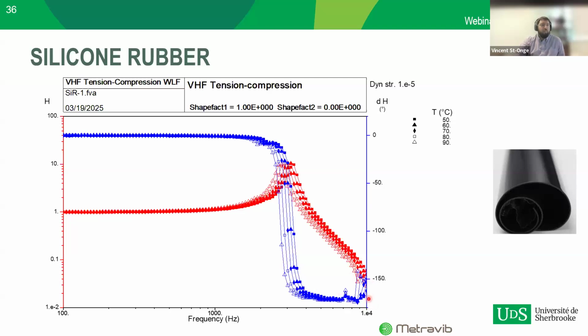So this can be due to poor sample preparation, or sometimes the sample preparation is simply challenging because you have a soft material and you need to cut it and maintain a very uniform and very flat surface. So these are part of the challenges that you can face. You do your best, and this is the kind of curve you end up with. So basically, we would limit the range of validity to about 6,000 hertz on this one. And then for the lower one, we take the resonance, which is about 3,000. So maybe 1,500 would be the limiting value.